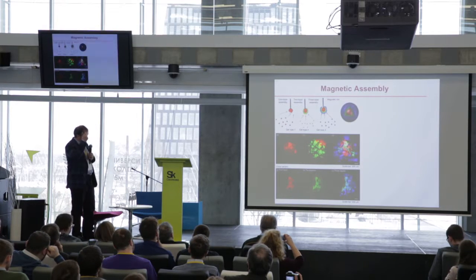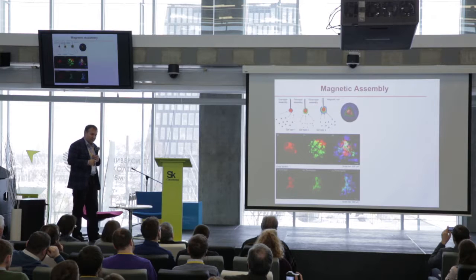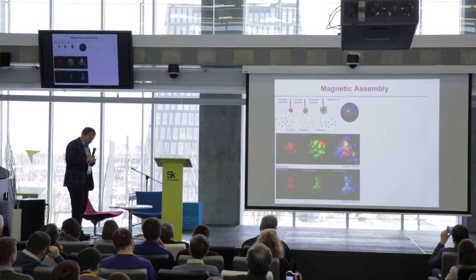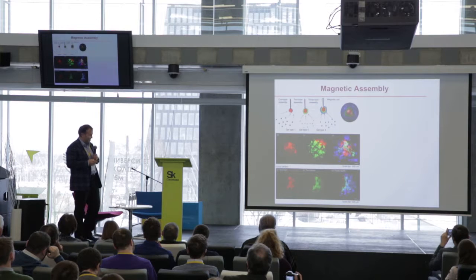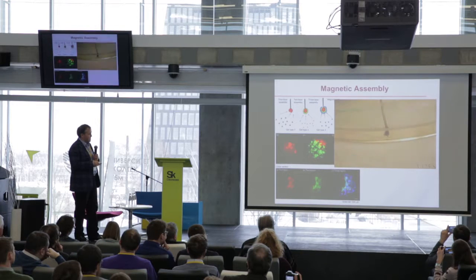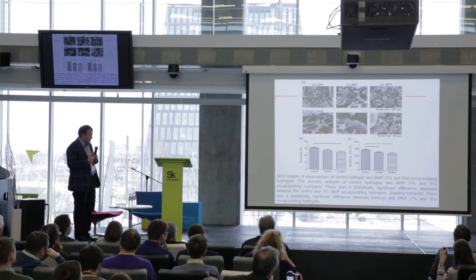And now we've been thinking with the 3D biosystems how to maybe use this to make a system that would not only work on Earth, but potentially work in space. That's an interesting project that I'm looking forward to see how far we can go. But we are trying to just create a magnetized system and collect everything and have this done very controllably.